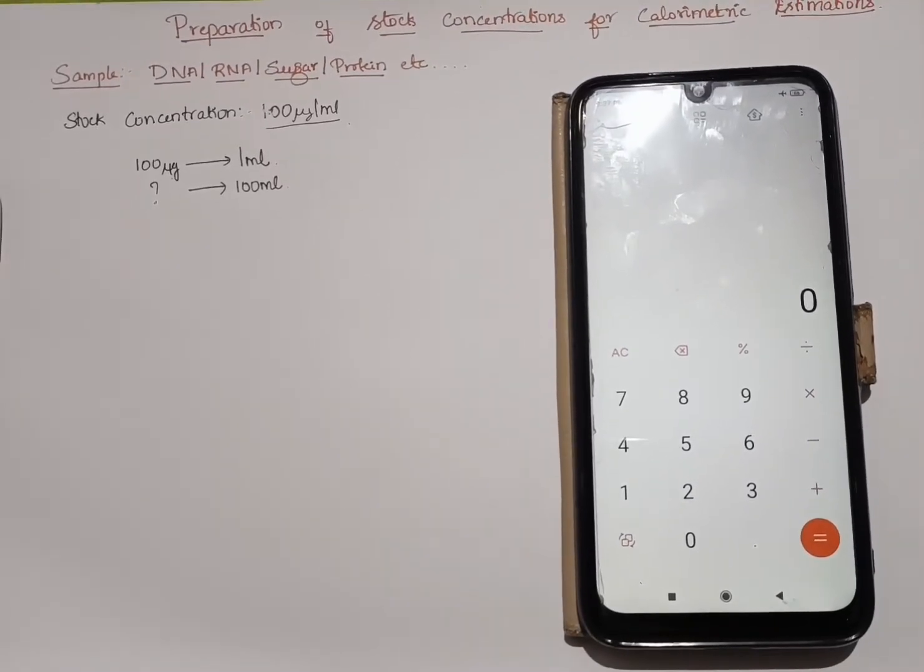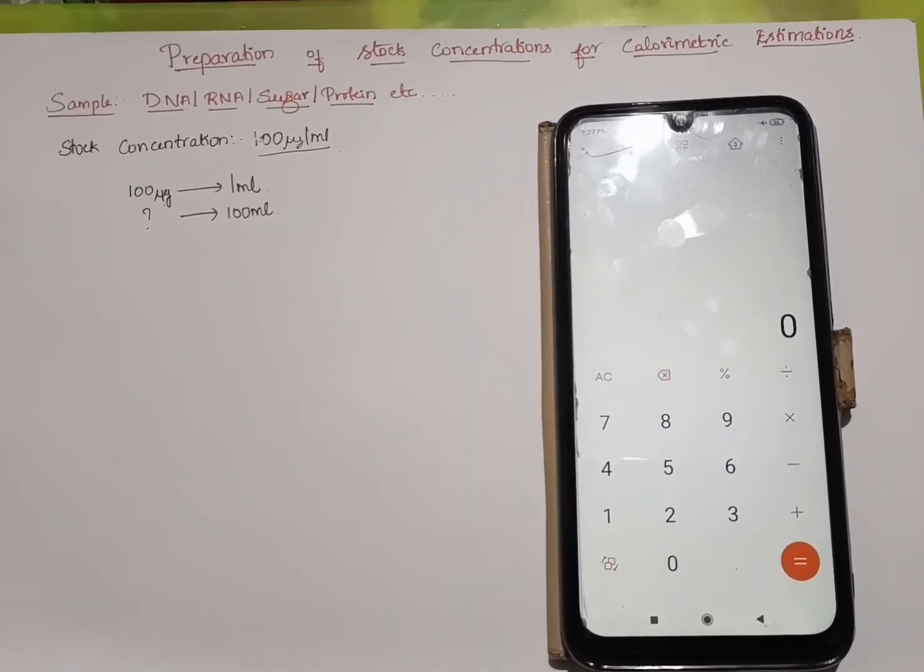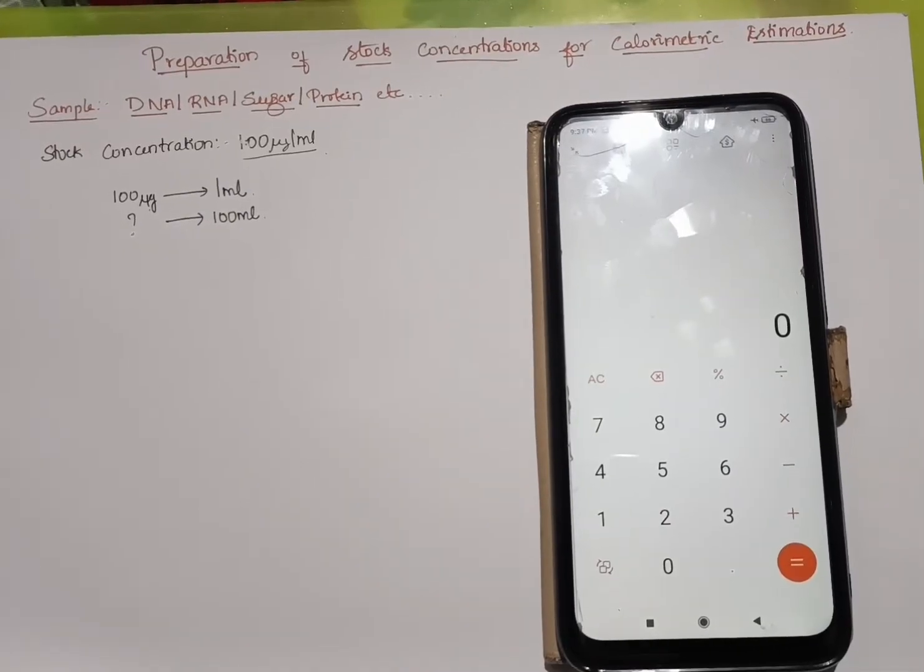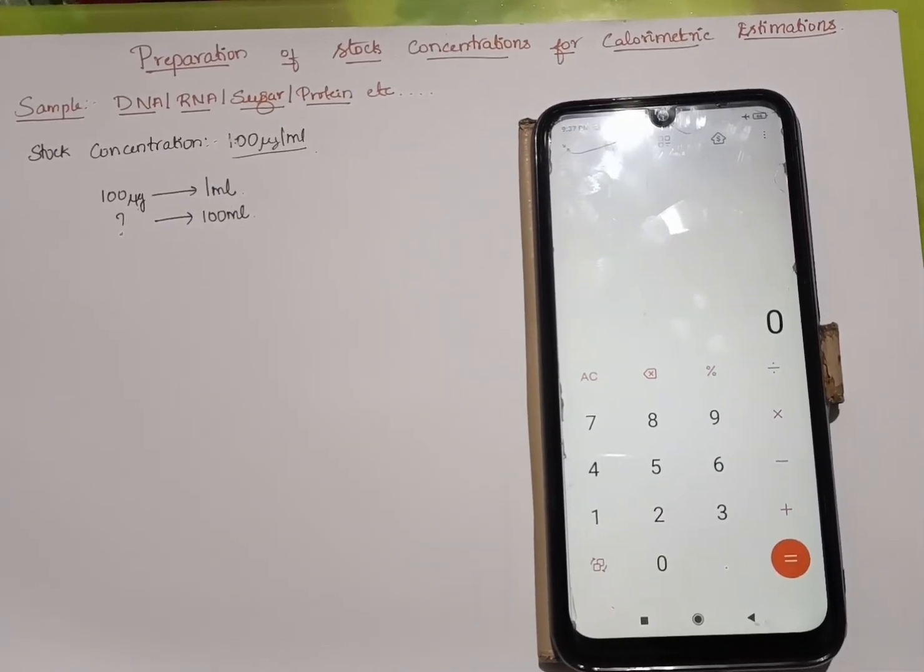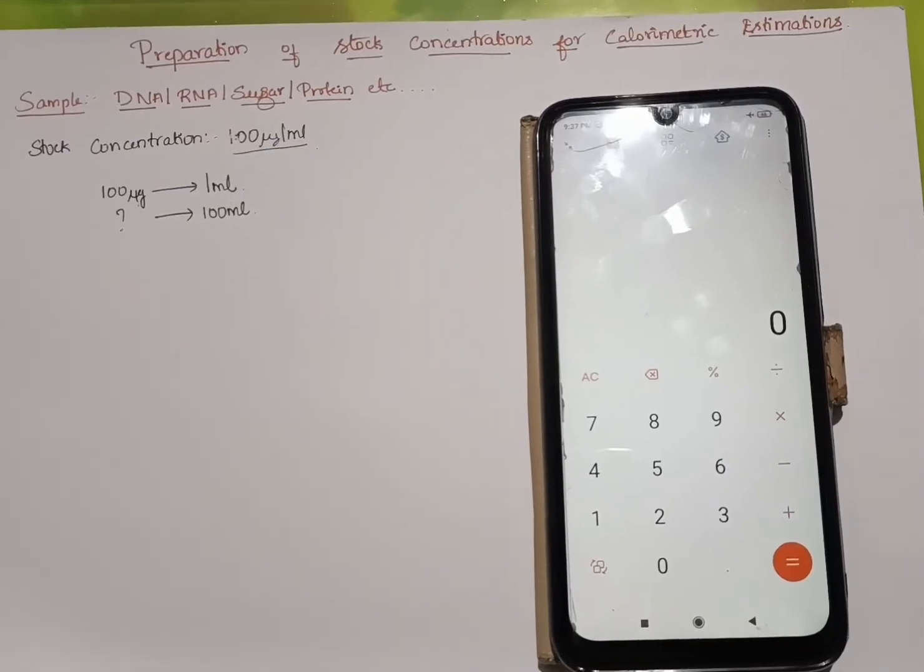Hello viewers, in this video let us learn about preparation of stock concentrations of various samples for calorimetric estimation or spectrophotometric estimation.